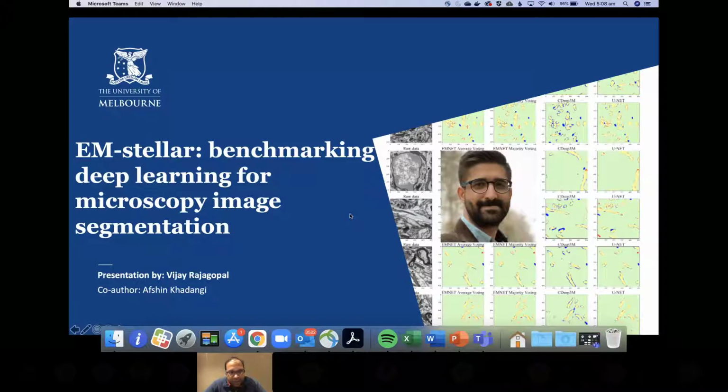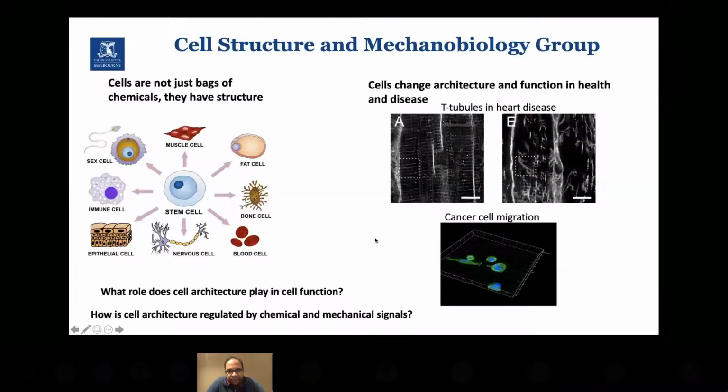So today I want to talk about some excellent work that our PhD student Afshin Khadangi has done in the deep learning space to benchmark electron microscopy image segmentation algorithms. Before I begin that, just to give you a bit of context of what it is that we do.